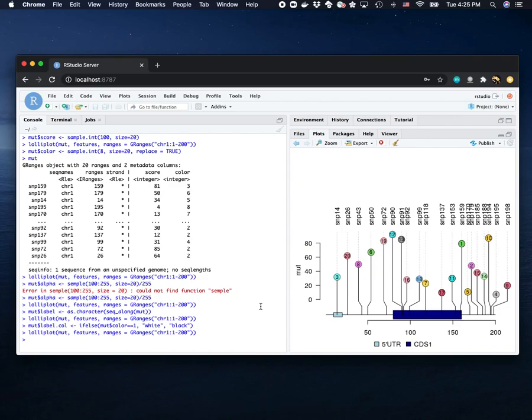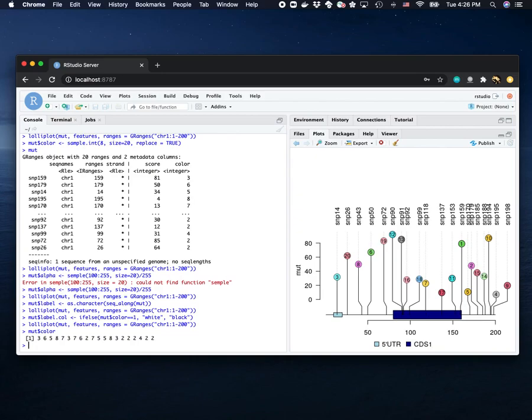It looks like it changed now. It happens there is no color equal to 1.